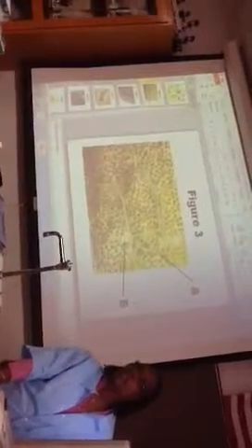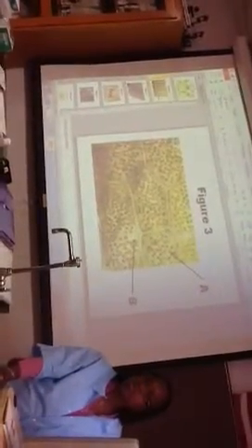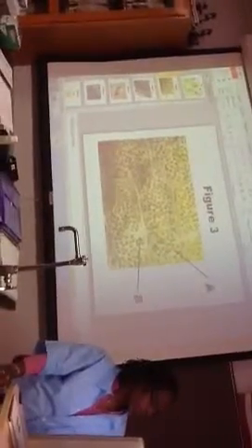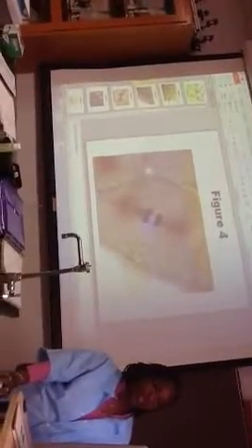This is your chloroplast, and what is this thing here? Vacuole. This one here? You can see the vacuole, the nucleus. B is the nucleus. What stage is that? Anaphase. You should know that right away.